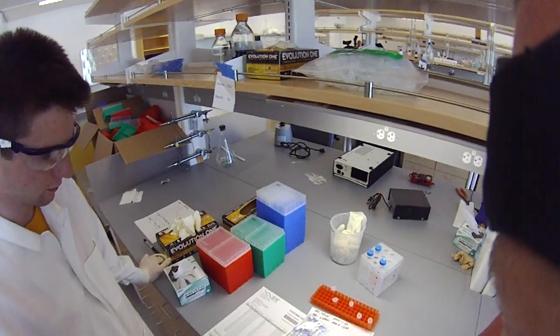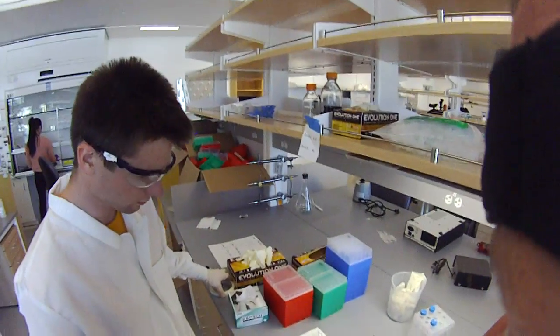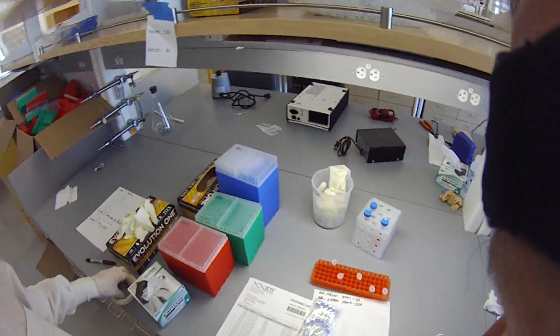At a scale like this — at 24 oligos — we're at the minimum scale where we could have ordered a plate, but it takes more time for them to ship a plate than the individual oligos. It's more convenient with a plate, but this works too.